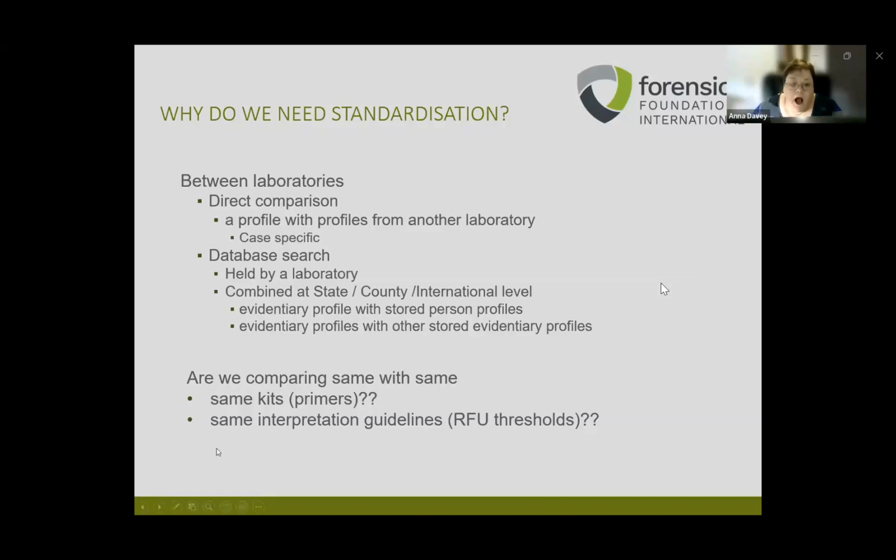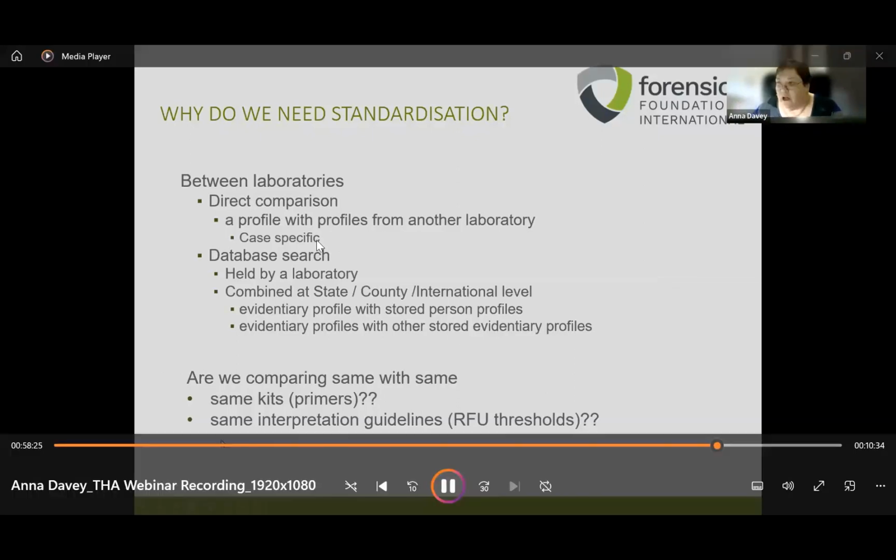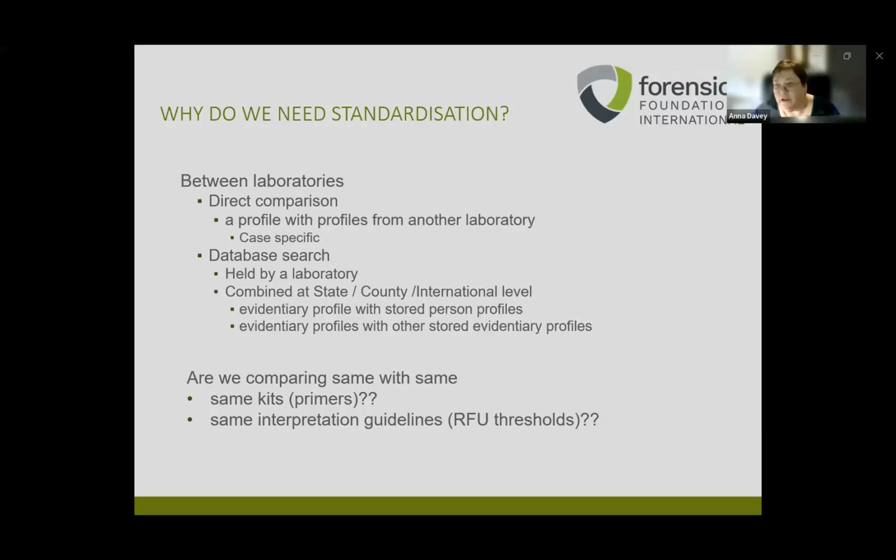Are people using the same interpretation guidelines? Some people are much more conservative than other people in terms of calling alleles. Different people interpret mixtures in different ways. So we're not comparing same with same when we've got databases.